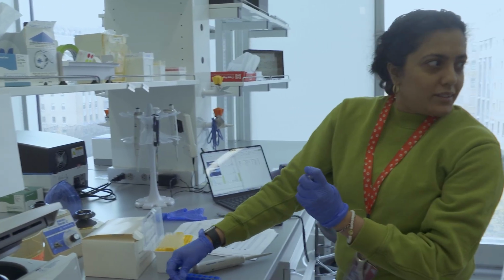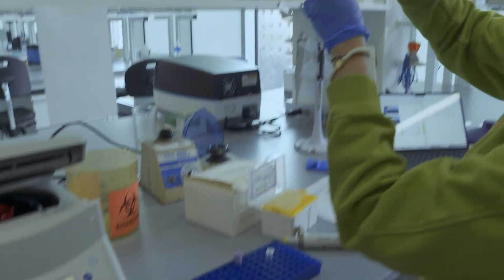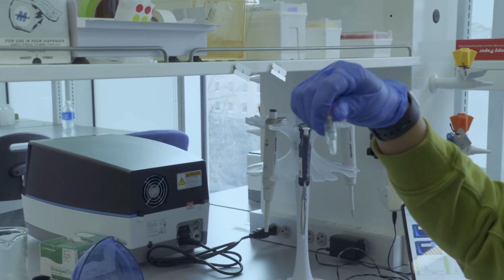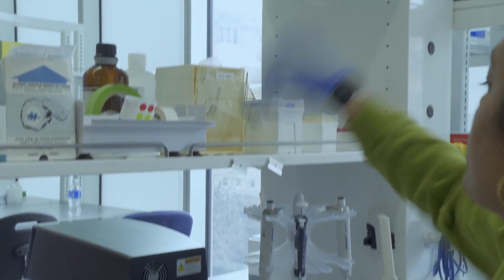So honey, yes, there is some precipitation here. That's okay. It's a buffer, right? Should I vortex it or no? No, just flick the tube and take the buffer. It should be okay.